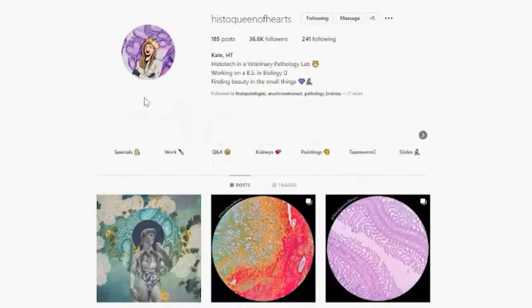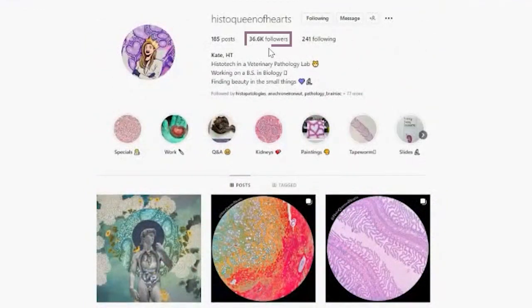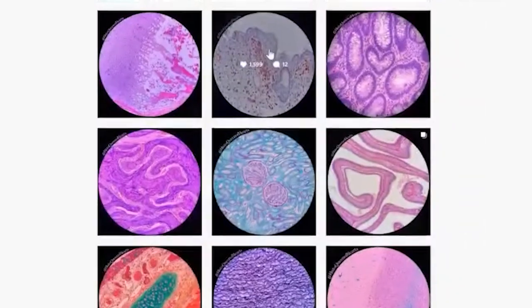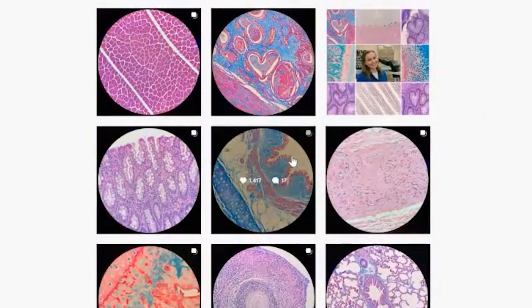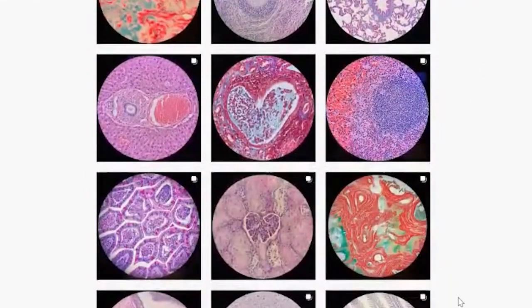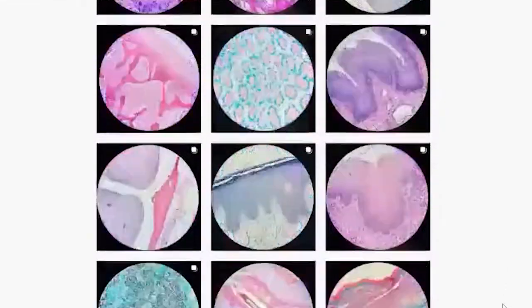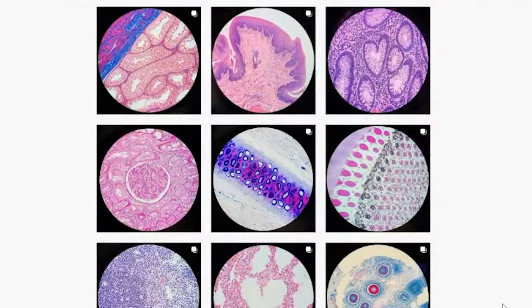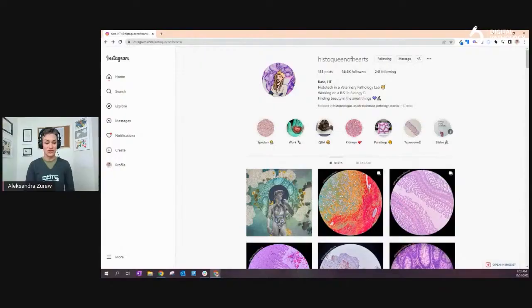Let me show you this other pathologist who is fantastic — she just uses her phone, I think an iPhone. She works in a veterinary pathology lab and has 36.6k followers — she's definitely insta-famous in the pathology world. This is her style of pictures. Here I think she didn't do white balance, here she did. She always puts the subject in the center and writes educational captions. I follow her and like all her pictures because they are really beautiful and informative.